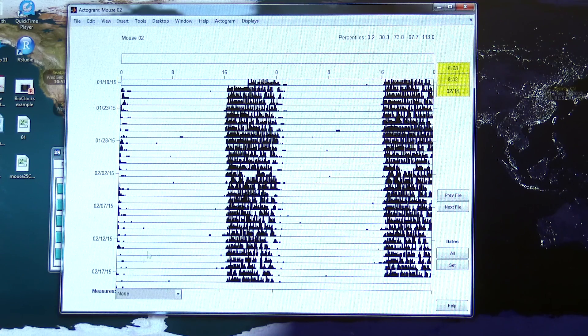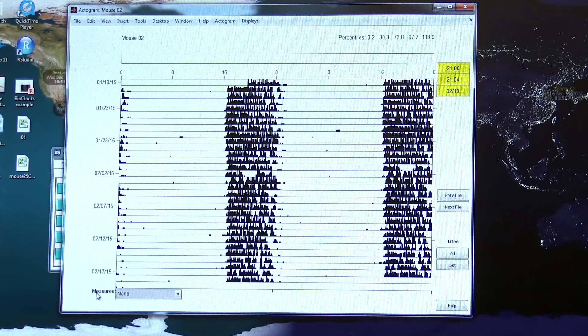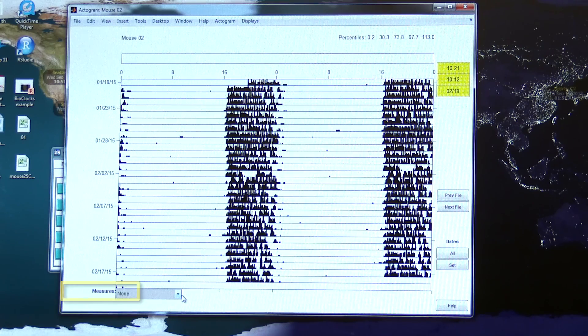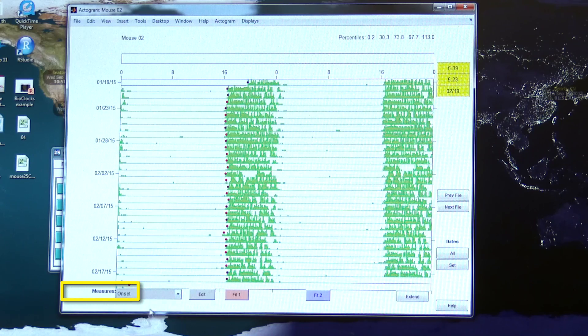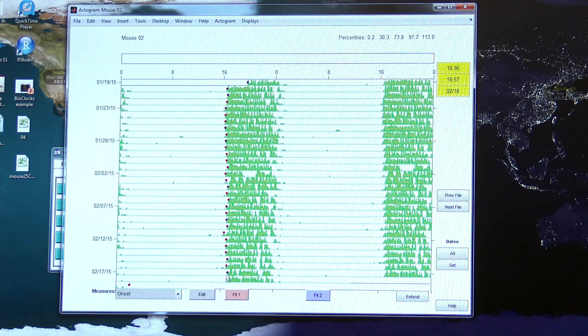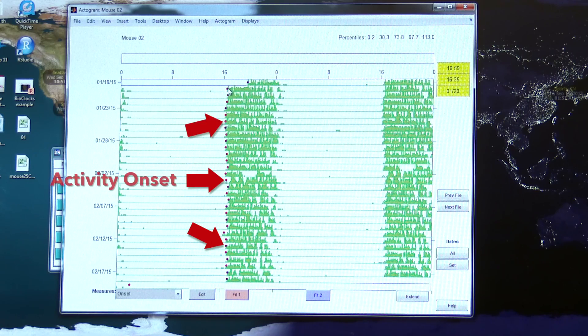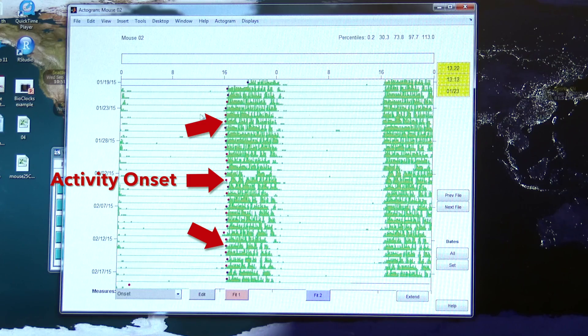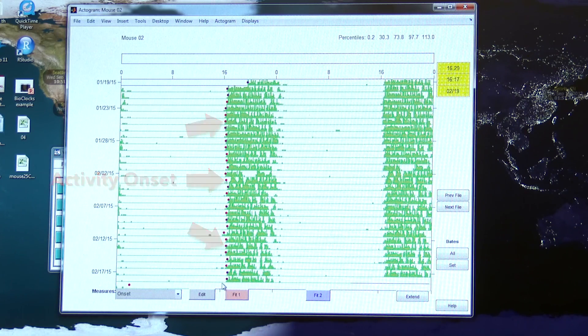ClockLab has a number of really useful tools. Under measures you can select to automatically fit the onset of the activity of the animal. These red dots represent where ClockLab, based on thresholds that you can set as the user, decides when the activity starts on each 24 hour period.